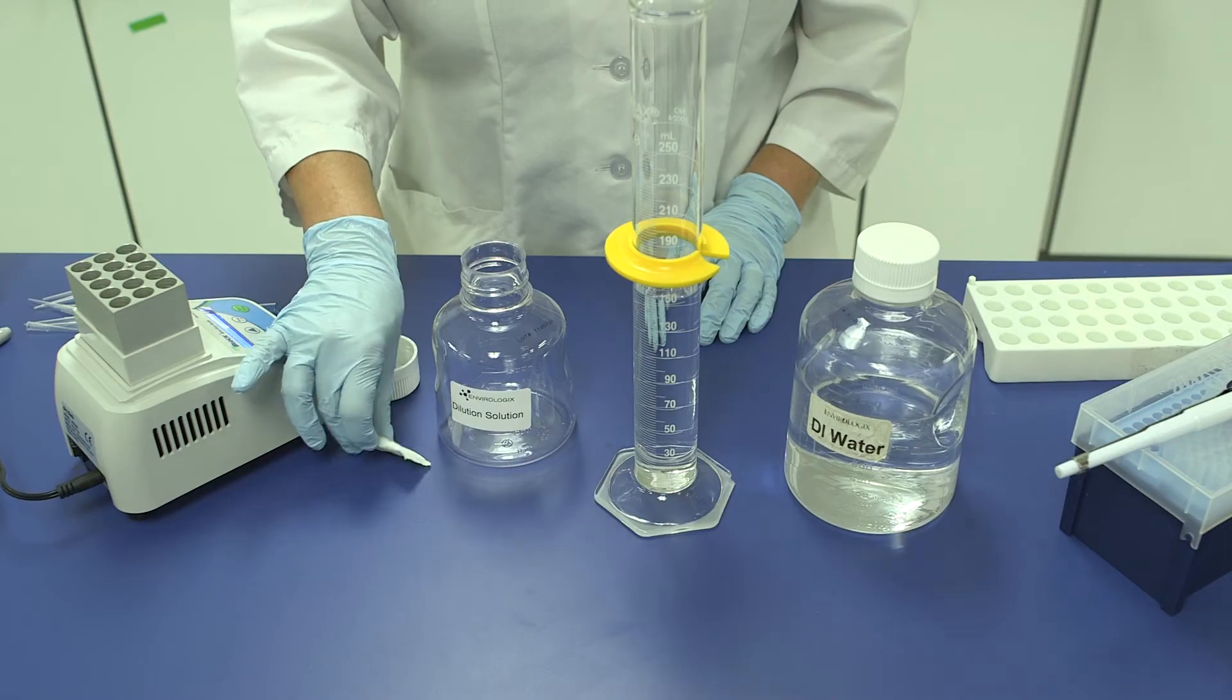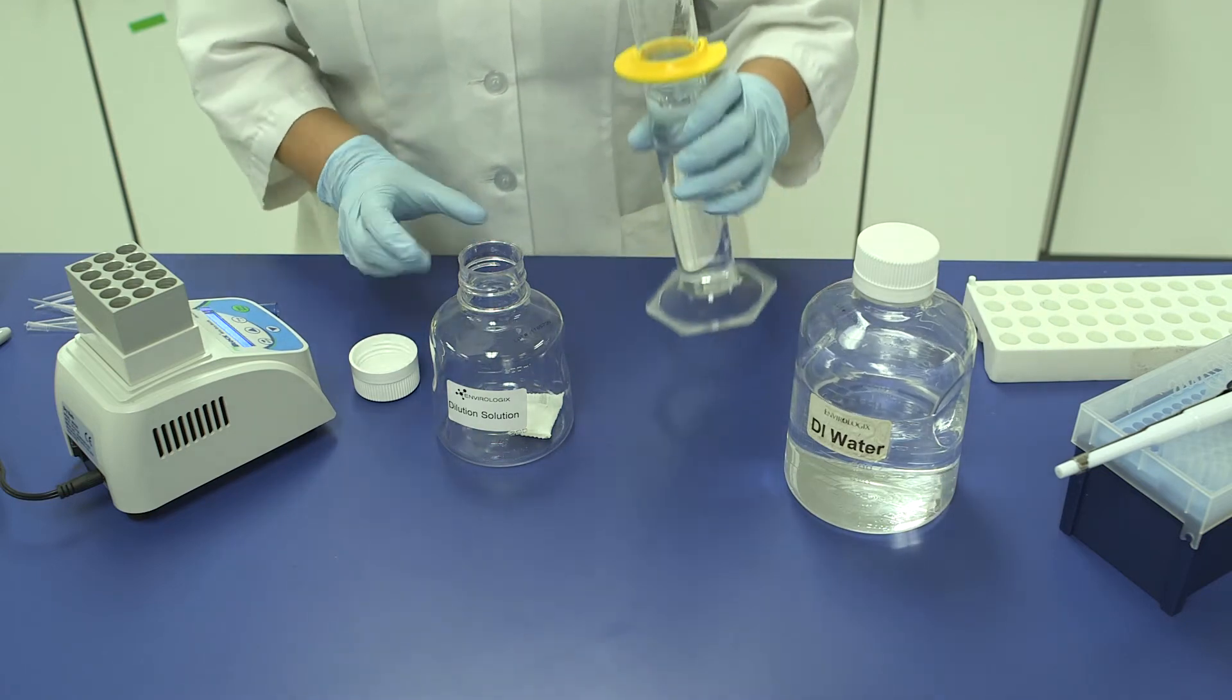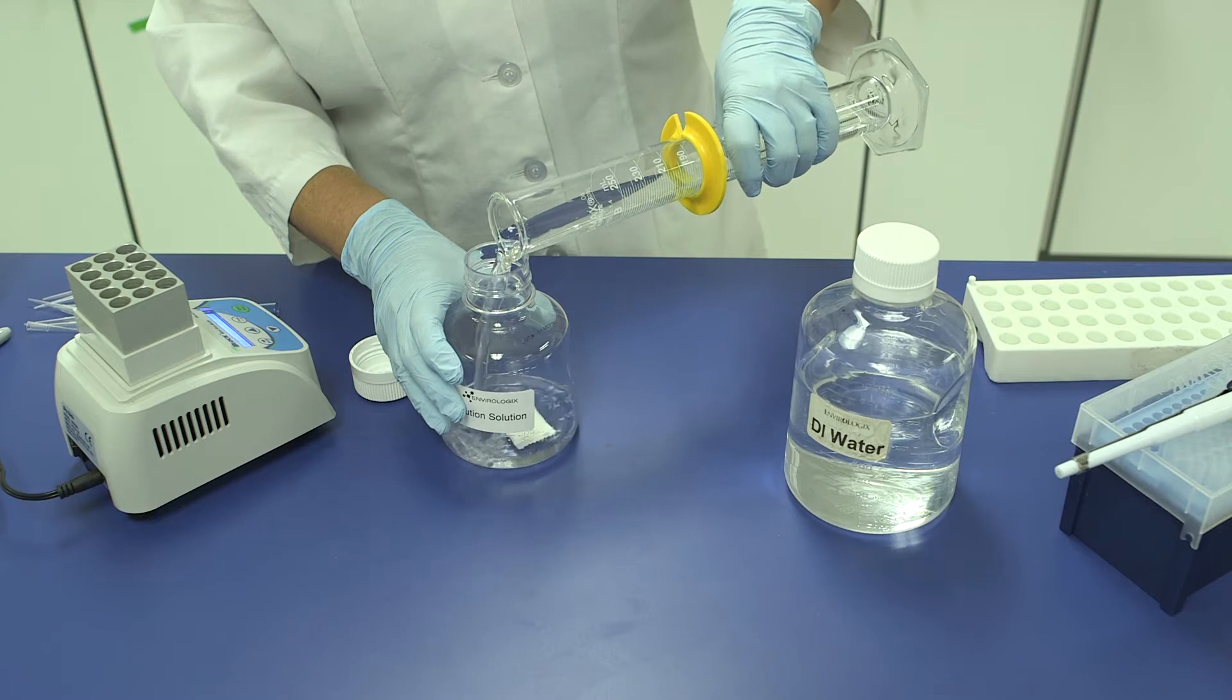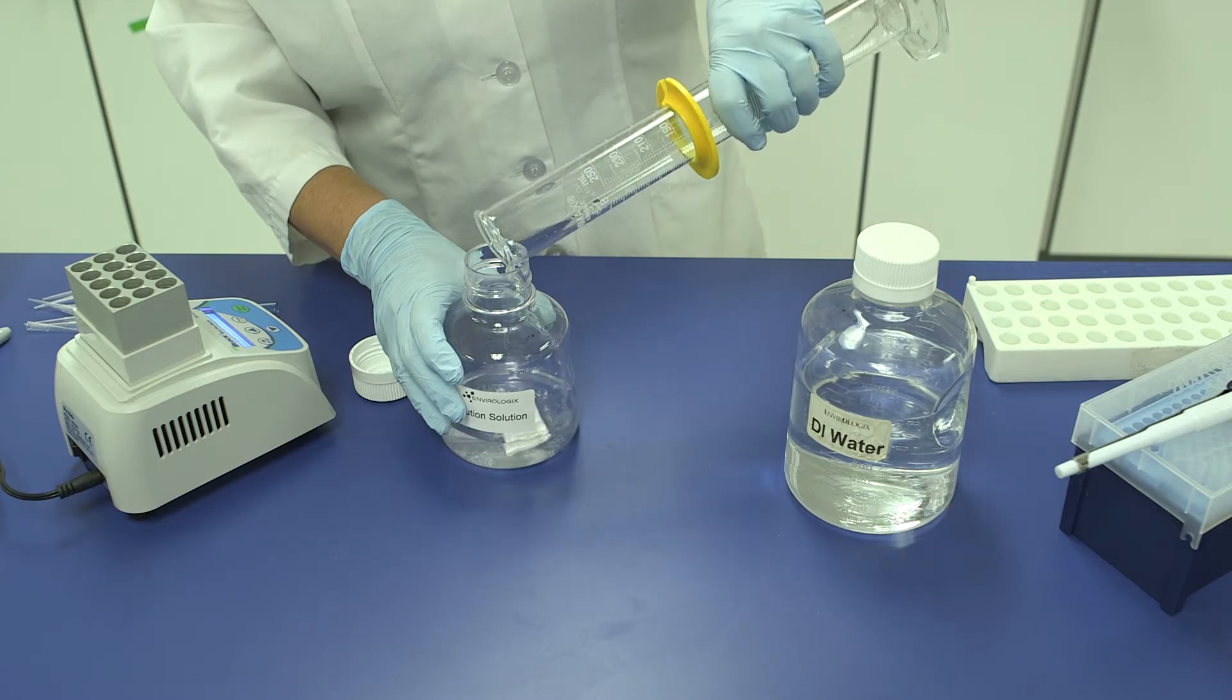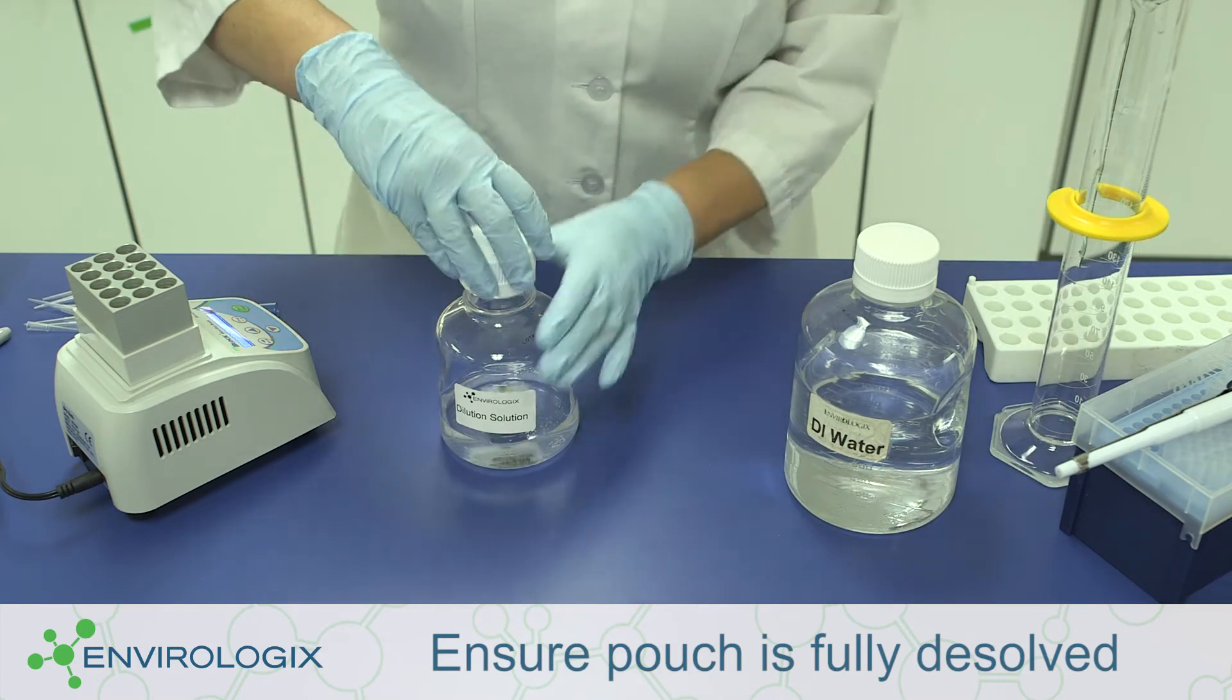Prepare the dilution solution as needed by dissolving one EB-17 pouch in 150 milliliters of distilled or deionized water. This can be stored according to the product insert instructions. Mix thoroughly before each use.